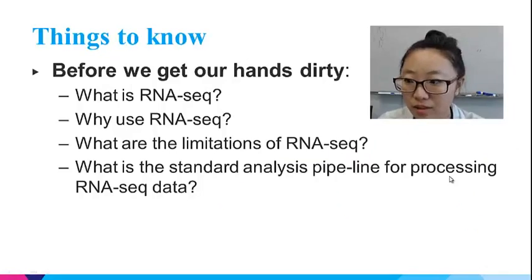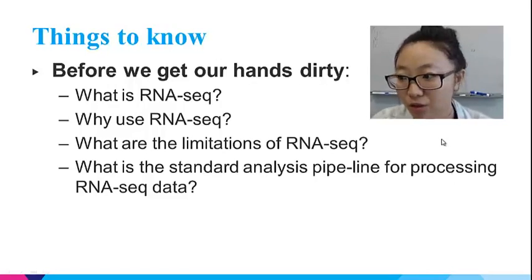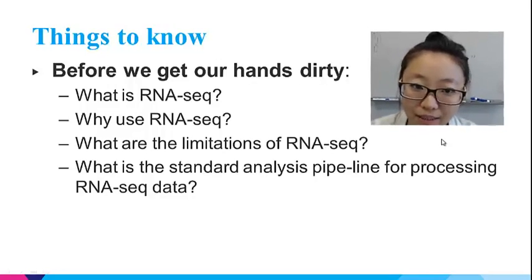Before we start the analysis, let's first review some simple facts about RNA seq. Why has it become popular among the research community in the past few years? What's the advantage of RNA seq over microarray? What are the limits of RNA seq? And the topic of this lecture: what's the standard pipeline to process RNA seq data?